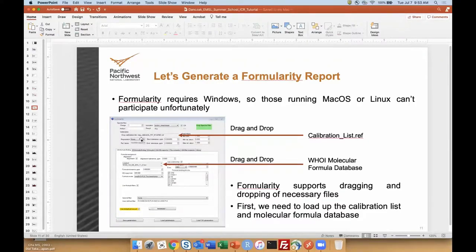So the first thing you need to do, apparently, again, this is for a very long time. Am I still on? Okay, good. Sorry, my VPN freaked out for a moment. Yeah, so you just need to take this drop-down menu and switch it to linear. That's a very good point. Thank you. That's pretty awesome.